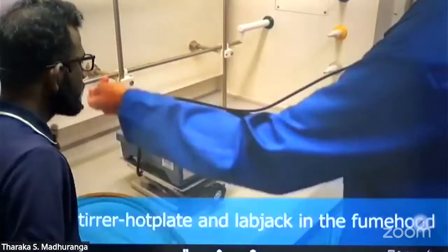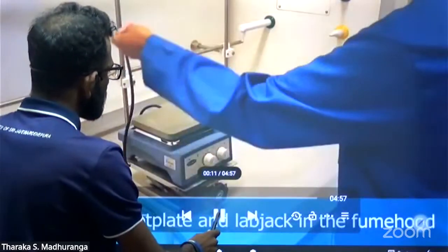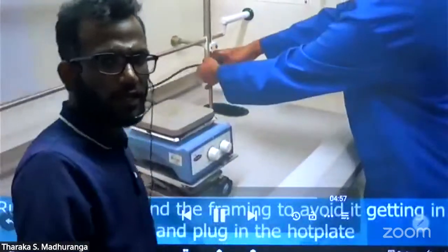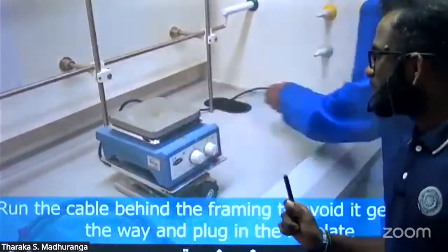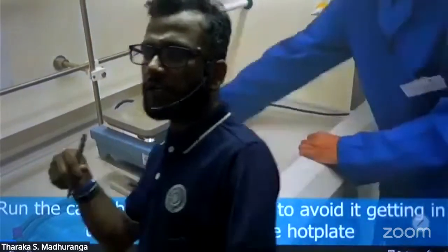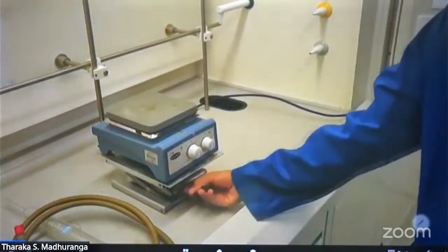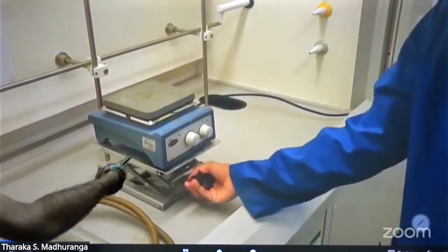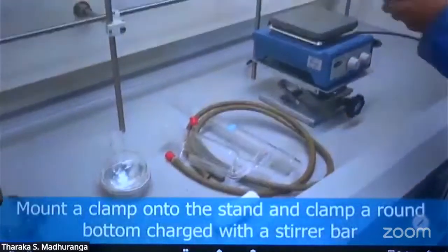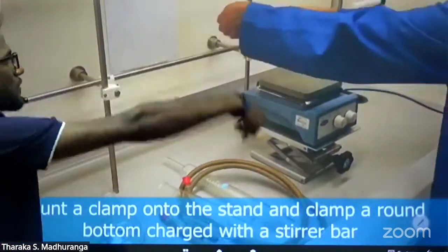Okay, this is the heater we use for this extraction. This is the heater. The heater is an electric heater. We can plug it in and switch it on. We can adjust it according to our heat requirement. Okay, that's a supporter.